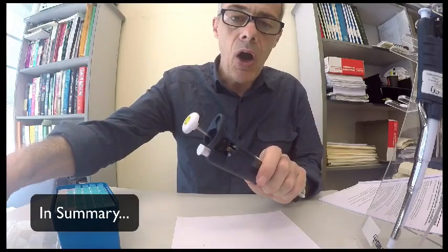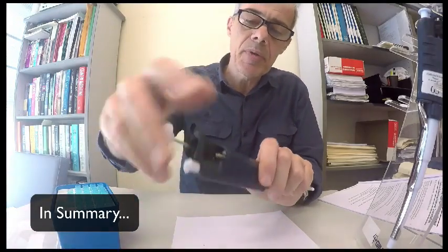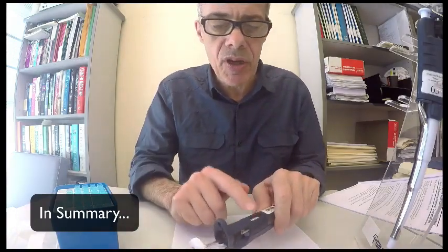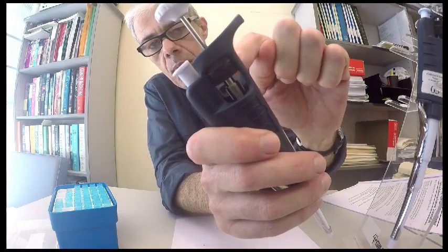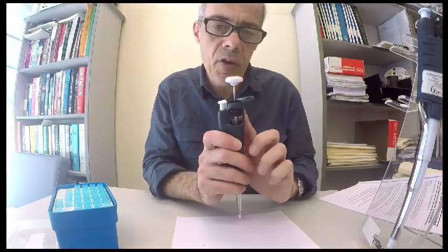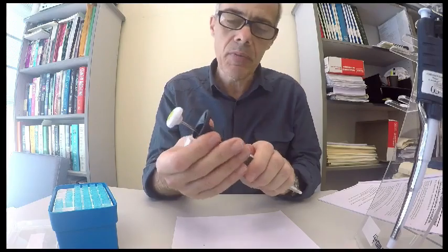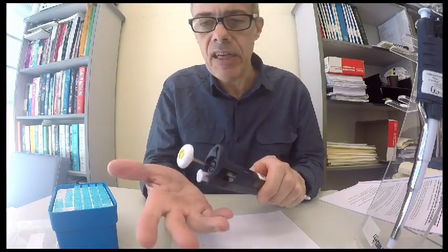Be careful when you're winding. It's very easy to overwind these things. Some people say, well, I don't understand what I'm doing, and I've got a P200 here, but this scale only goes up to 200. I want to wind it up to 500. Because you're confused, you think it's 50 or whatever. And if you keep winding this thing here, which I'm not going to do, then this wheel here will start to exert a lot of pressure in that orientation outside of where you can hold it comfortably, and you're going to damage the machine.